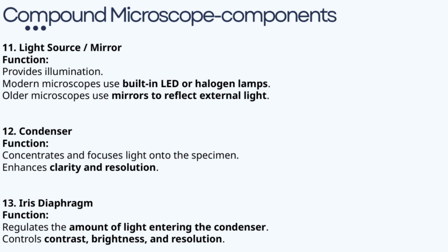Together, these components, the light source, condenser, and iris diaphragm, work seamlessly to ensure you get the best possible image quality from your microscope, tying into the broader theme of understanding how each part contributes to effective microscopy.